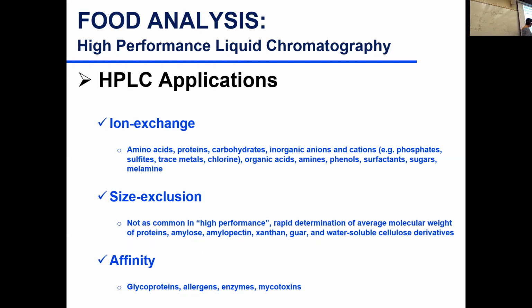Affinity, so this is very specific chromatography. Mostly it's used for proteins, to separate glycoproteins, separate antigens, purify allergens, purify enzymes, or we can use it for detection of mycotoxin, which is not a protein.